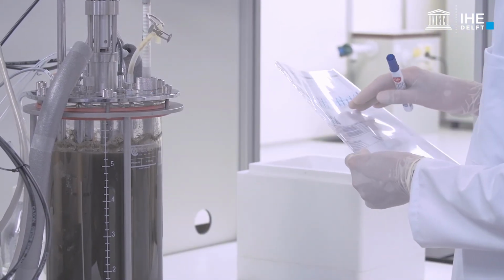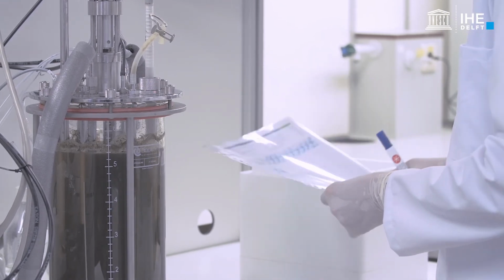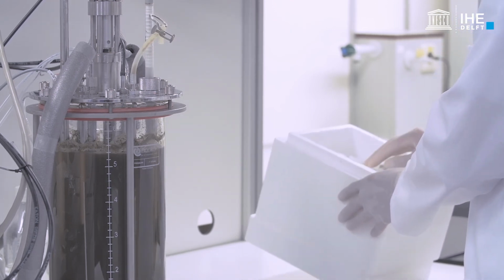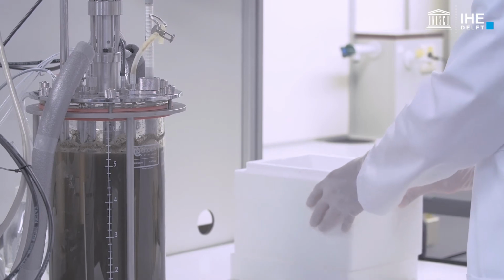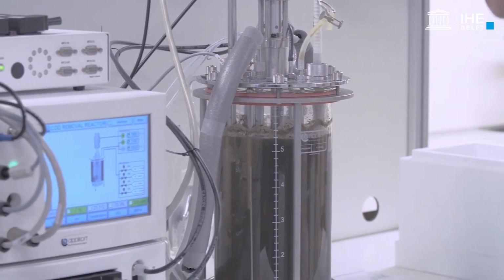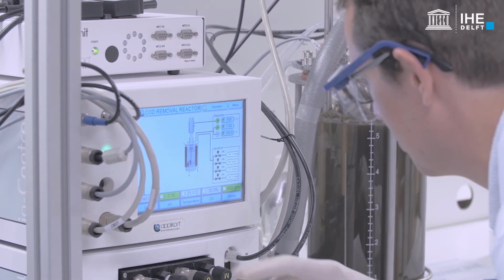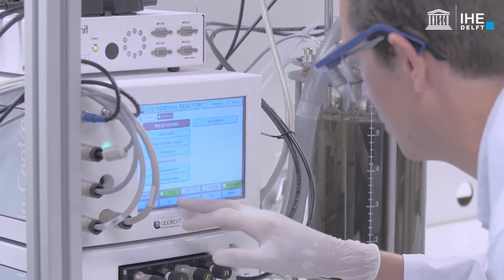At the end of the test, confirm that all the required samples have been collected. Verify the stability of the parameters of interest and stop the operation of the reactor.